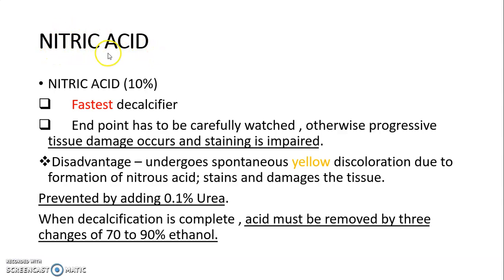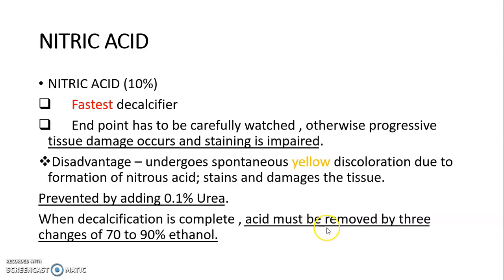10% nitric acid is the fastest decalcifying agent. However, the endpoint has to be carefully watched; otherwise, progressive tissue damage occurs and staining is impaired. A further disadvantage is that nitric acid undergoes spontaneous yellow discoloration due to the formation of nitrous acid, which stains and damages the tissue. This can be prevented by adding 0.1% urea. When decalcification is complete, the acid must be removed by 3 changes of 70–90% ethanol.